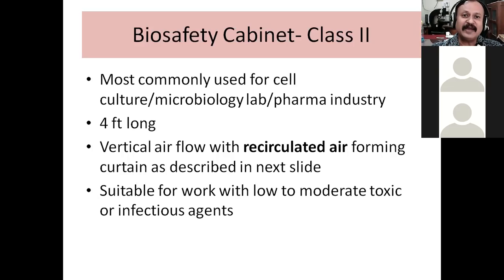But if you compare how clean that air is as compared to the outside air, then probably this air is much cleaner, and therefore you don't want that air to just go waste. Already clean air, isn't it? And therefore, even if you recirculate it, you are actually going to put lesser pressure or lesser load on the HEPA filters, isn't it? So your HEPA filters are going to have that clean air, already once cleaned air, and that is going to be recirculated. And therefore the HEPA filters will be actually protected. Do you understand what I'm saying?